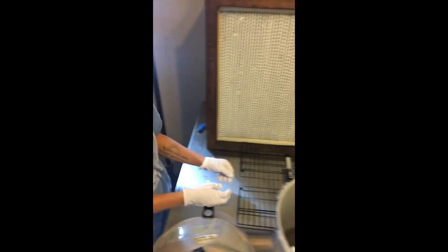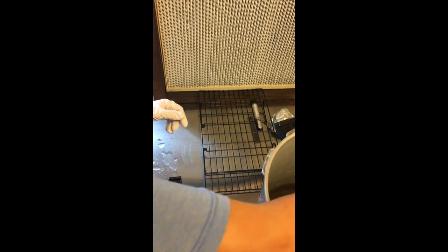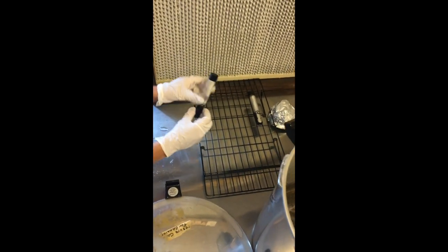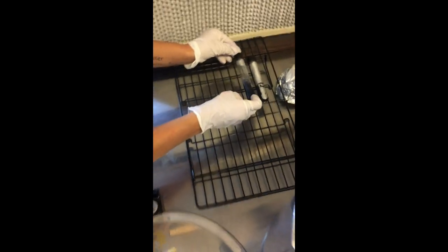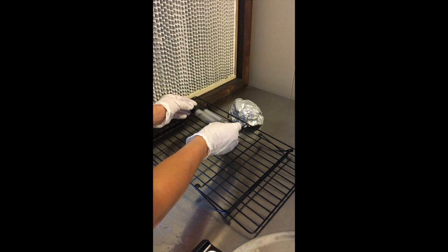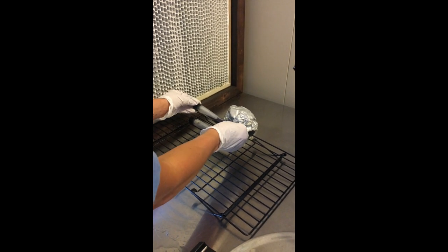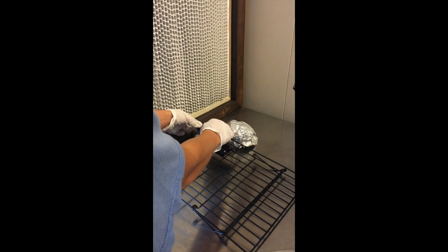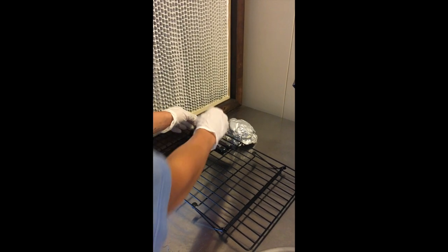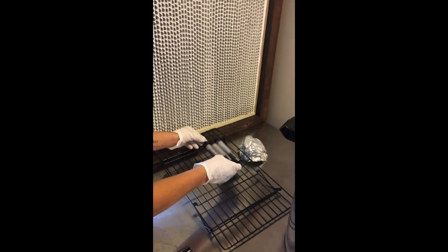That actually works quite nicely. I put it on an angle on my rack and it leaves a good angle for the agar to cool down the way we want it, with the openings facing the flow hood. The flow hood should be blowing sterile air in, and I still want these cracked a little bit until they're totally solidified, and then we can screw the caps on tightly.